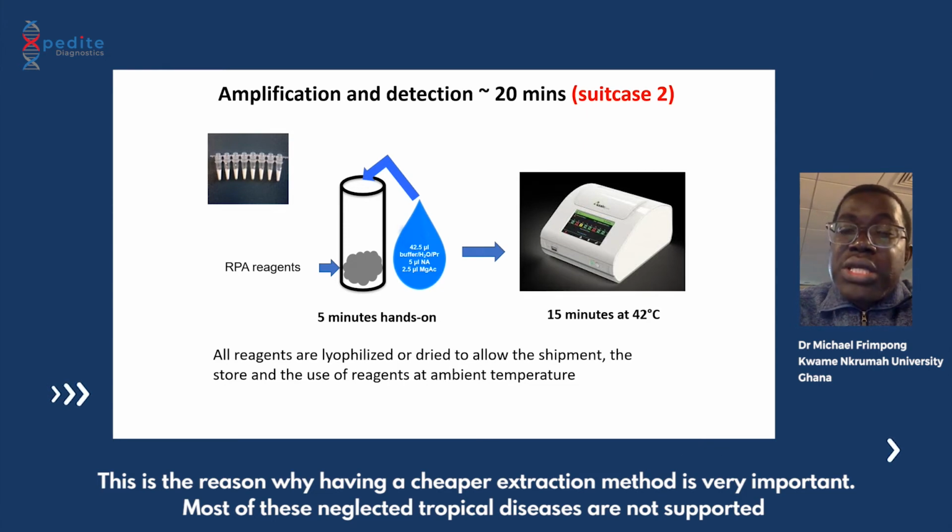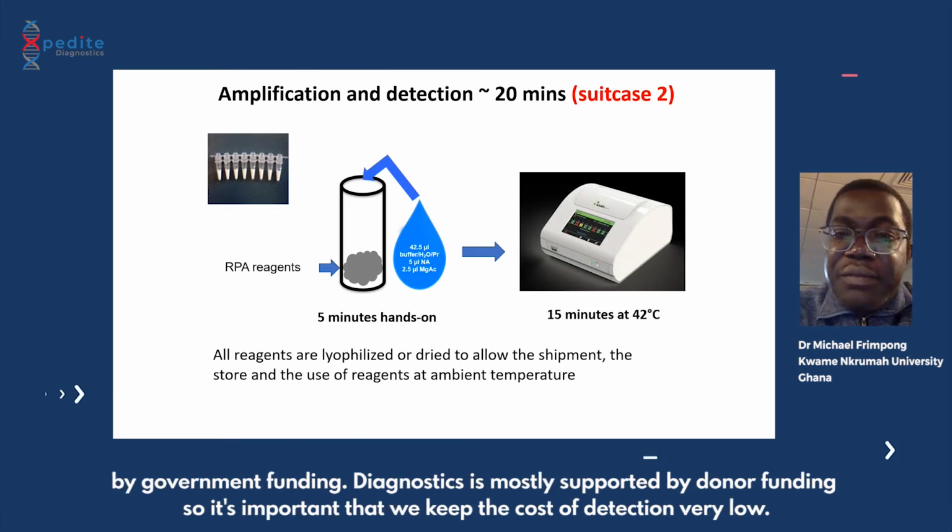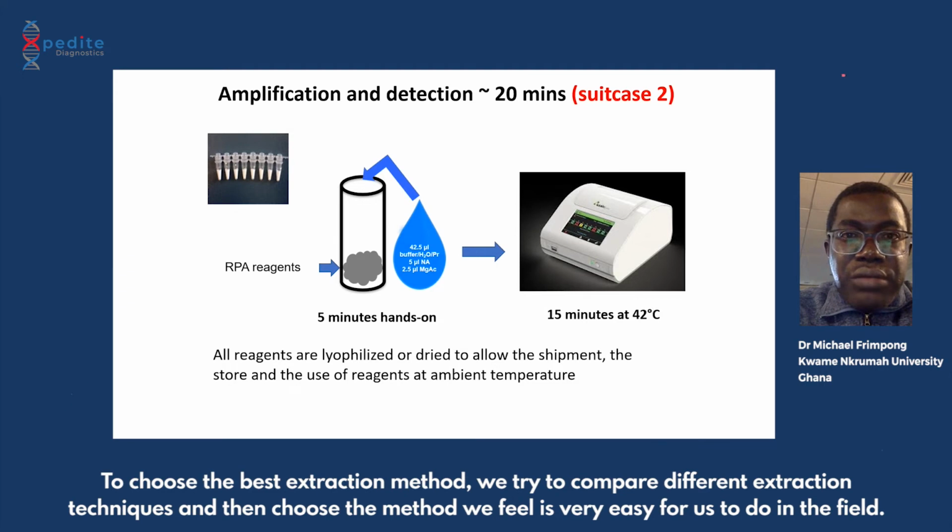And of course, most of these neglected tropical diseases are not supported by government funding. It is mostly through donor funding. So it's important that we keep the cost of detection very low. So what we did was to compare different extraction methods.